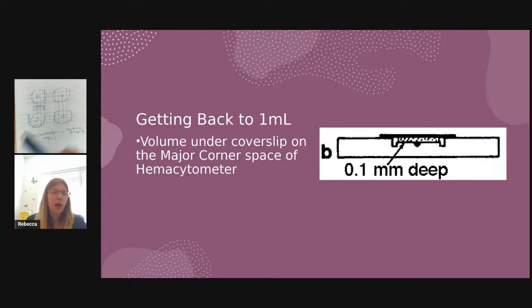Now, it's possible if you have smaller cells or something like that, that you count some of these internal areas that we don't count, and those will have a different area depending on what part of those parts you count, right?